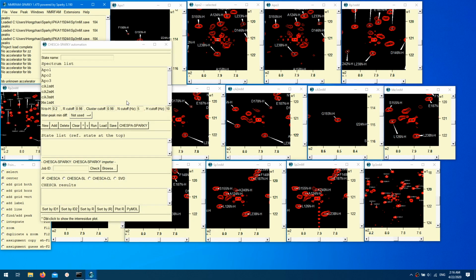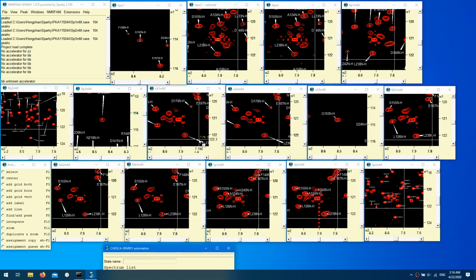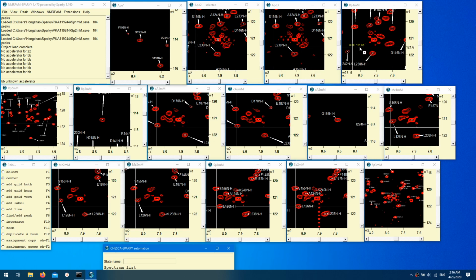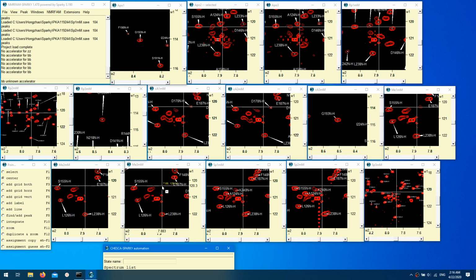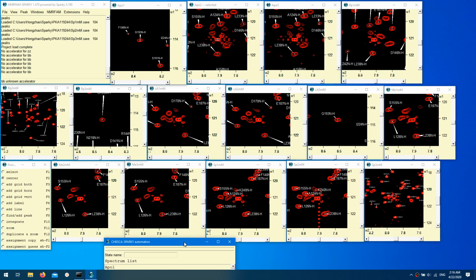CHESCA relies on a library of different ligand bound or mutation, active or inactive states, and when necessary, the intermediate states. We recommend at least 5 states for each analysis. In our example, we have the APO and RP cyclic AMP as bound states as the inactive states, and cyclic AMP, 2'-methyl cyclic AMP, and the SP cyclic AMP as bound states as the active states.